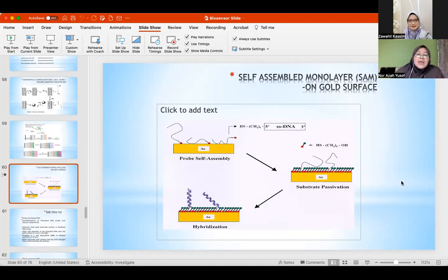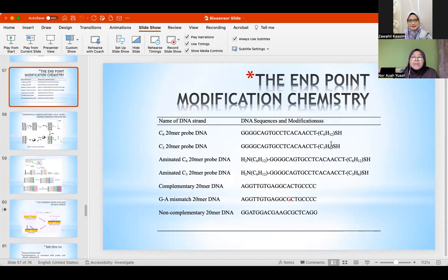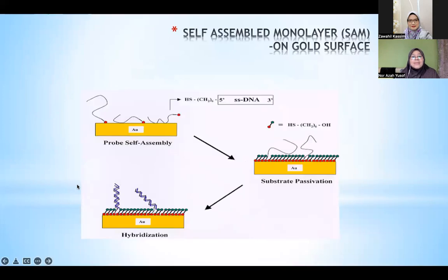This is another chemistry, covalent also, but this is using thiol. Thiol is sulfur. So you can see this is DNA. I did show you just now that we can also order a DNA probe with thiol end. So how to use that? Usually thiol or sulfur has this affinity towards gold. Affinity means that they love gold. Thiol, sulfur, will automatically bind itself to gold.